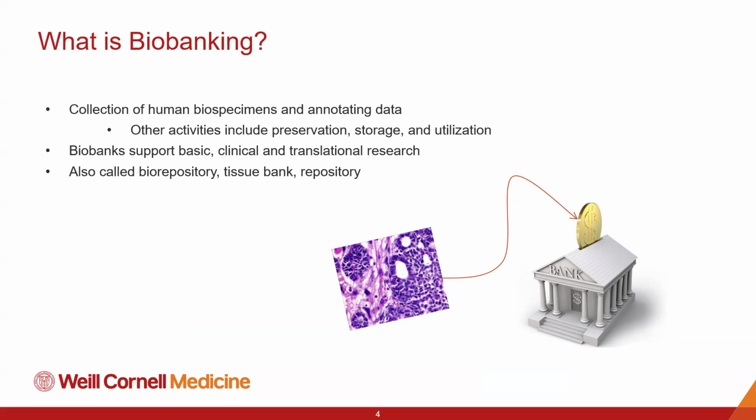Biobanking overall supports both basic clinical and translational research by providing vital resources, those vital resources being biospecimens that can be used in research. When I think about biobanking, I really think about any sort of tissue or biofluid that comes out of the human body that is then stored for later use. You will hear me refer to a biobank also as a biorepository, as a tissue bank, or just a general repository throughout the discussion. But all of those are interchangeable with biobanking.